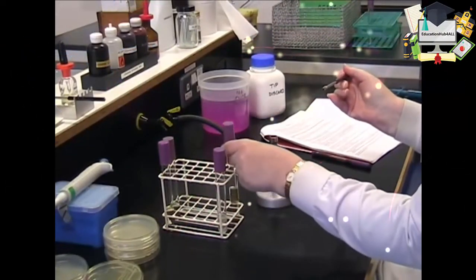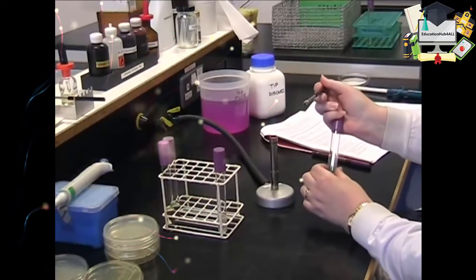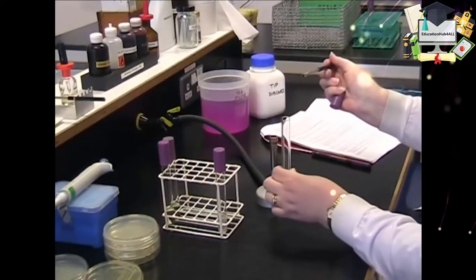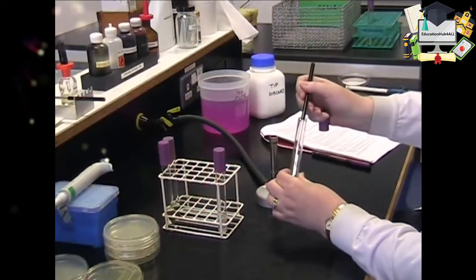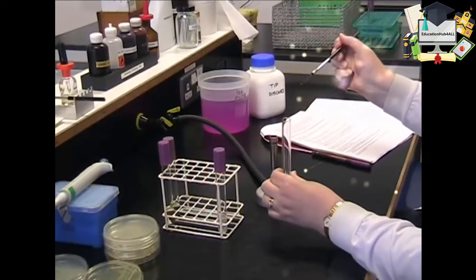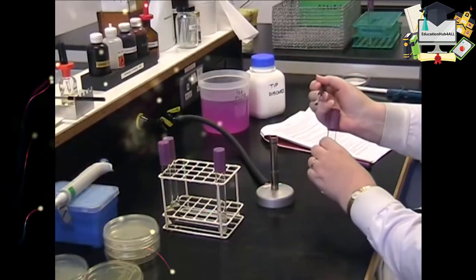We're now going to take a fresh tube and inoculate it. So as before, we remove the lid of the tube with our pinky finger, flame the neck of the tube, place the loopful of culture in the broth, remove our loop, flame the neck of the tube, return the lid and place in our rack.